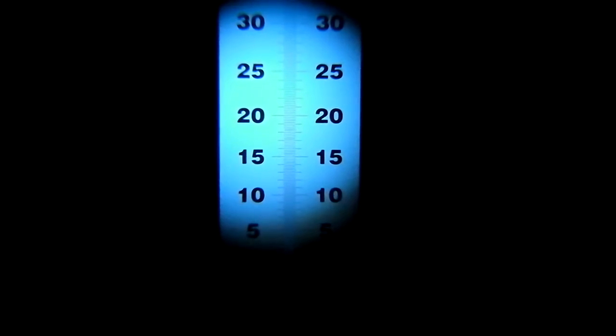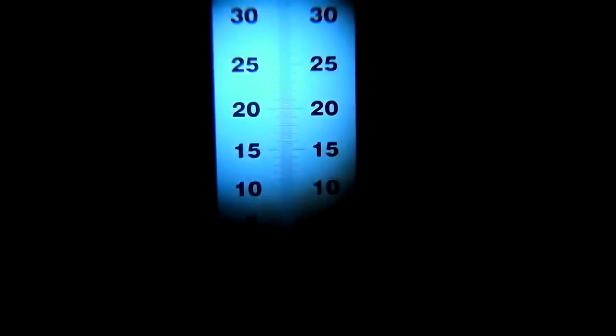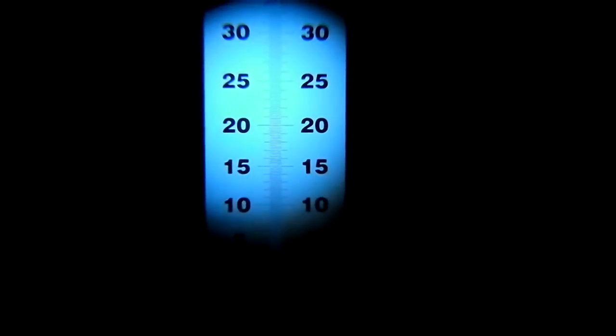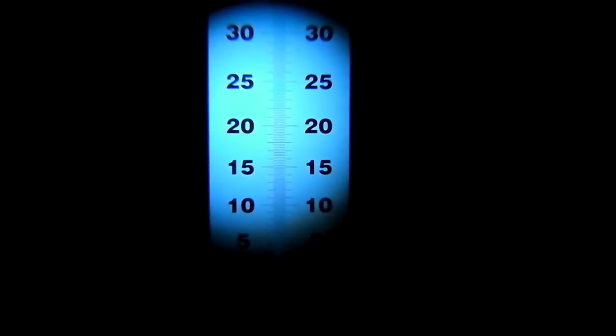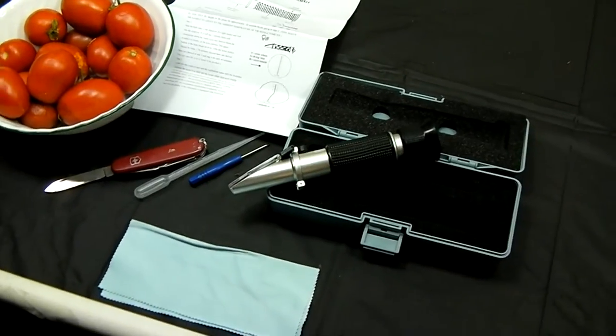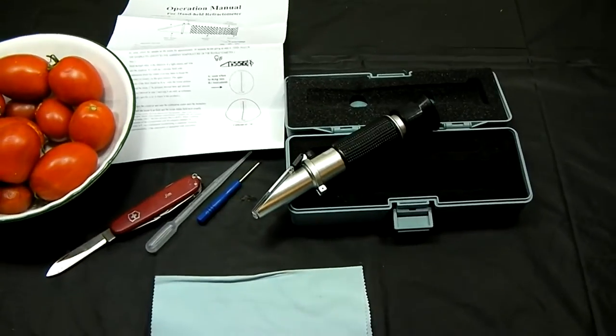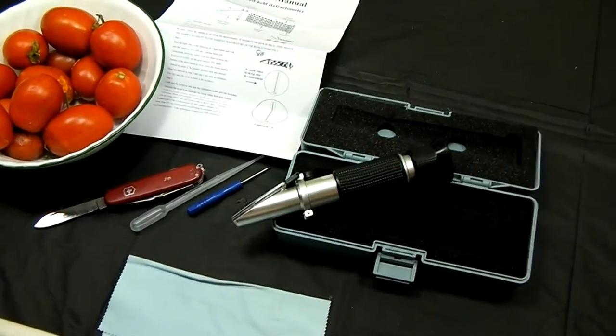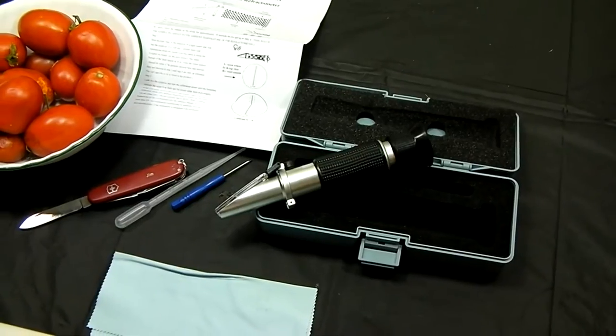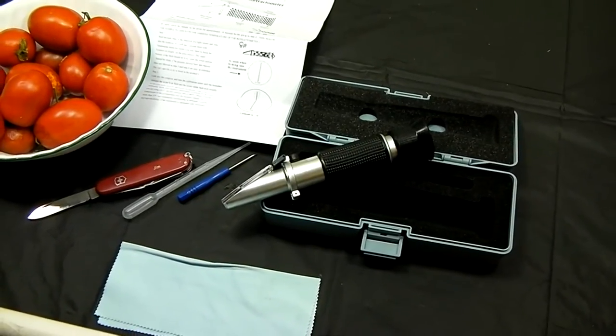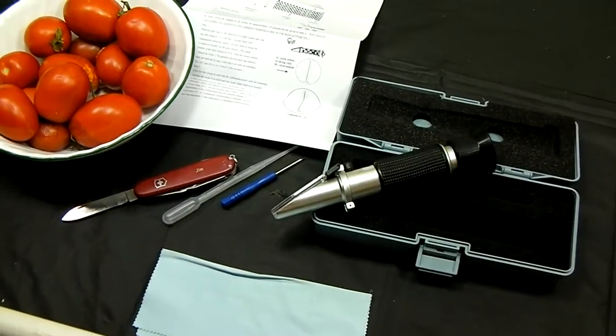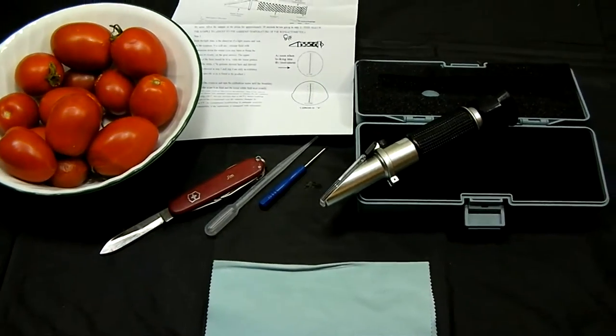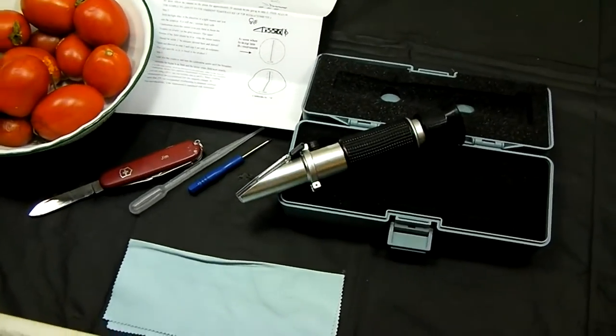This is looking inside the scale. You can see it goes from 0 to 30 on this one. This is actually looking through the refractometer. You can get these in different scales. The 0 to 30% is good for fruits and vegetables. For our purposes, for checking your fruits and vegetables, the 0 to 30% is fine.